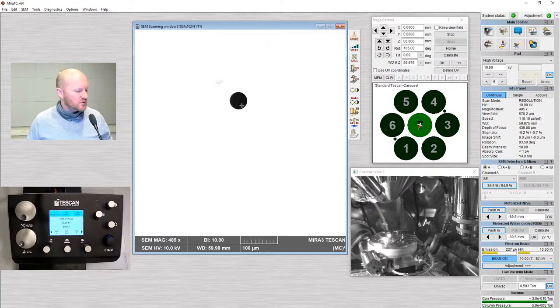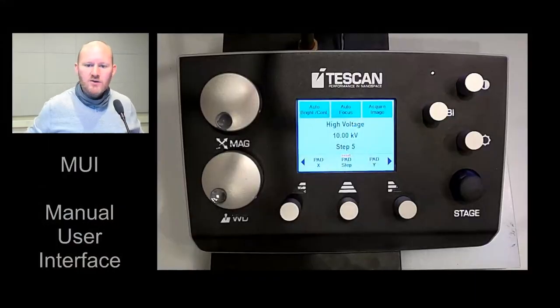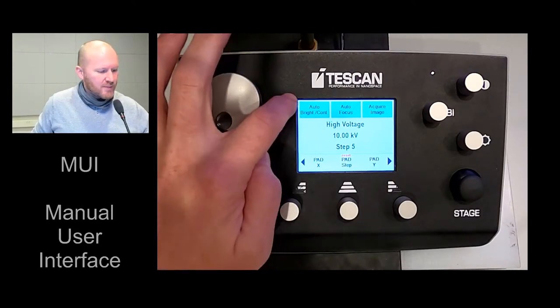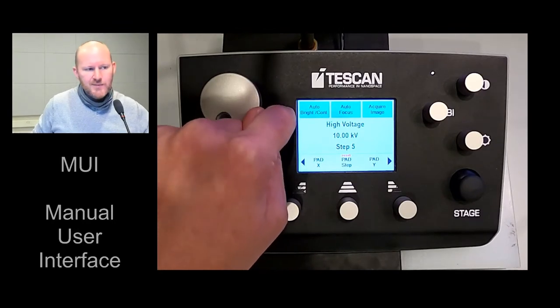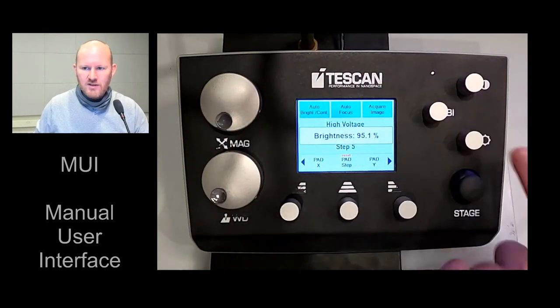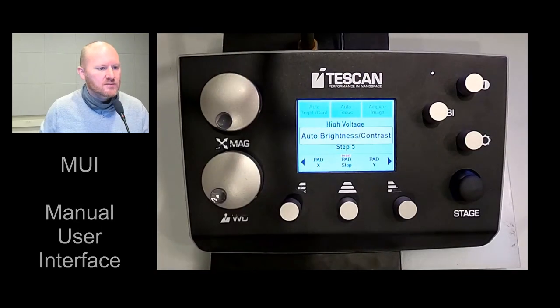We see a dark circle in the center and a bright white outline. I'm going to use the auto contrast and brightness button. Let me switch over to the MUI — the manual user interface. This is a touch screen. There's a button here for auto contrast and brightness. I use that pretty much every time just to get me in the ballpark. I can also change contrast and brightness with these two knobs, but often when I start it's way out, so I'll just hit the auto.